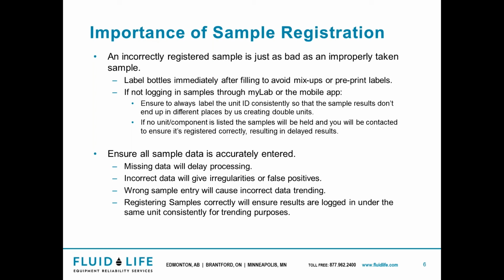And that results in them not having to come back to contact you guys, asking where is this missing data? So it's really important to be sure all sample data is entered correctly. Missing or incorrect data can delay the processing, and properly registered samples can ensure good, accurate oil analysis.